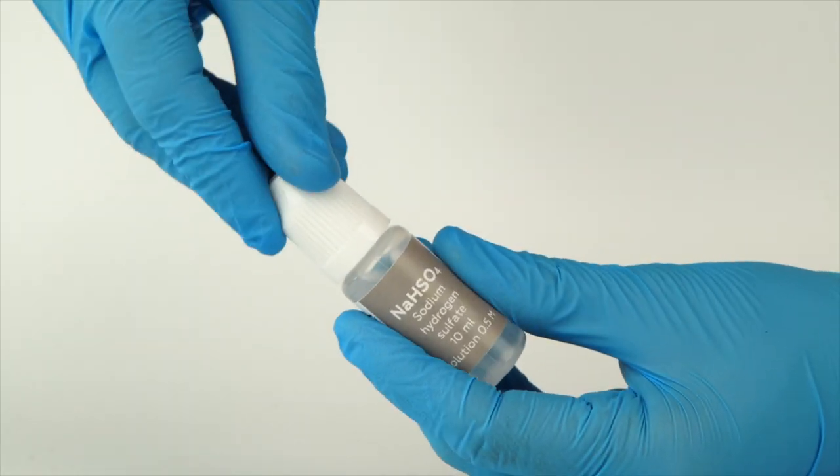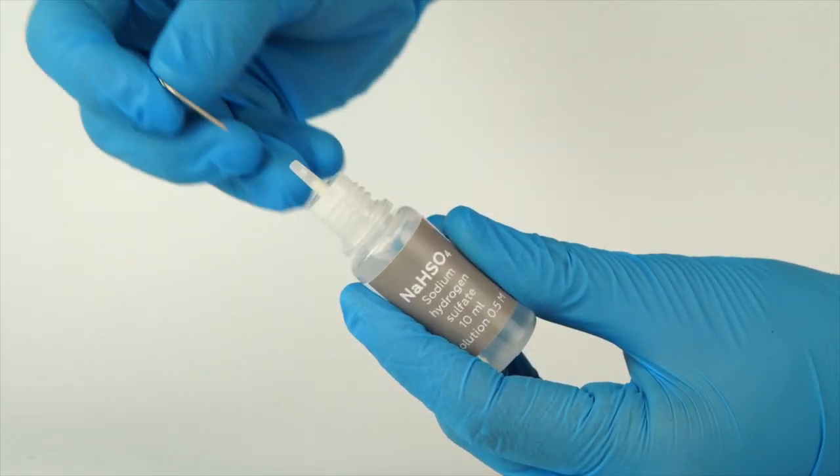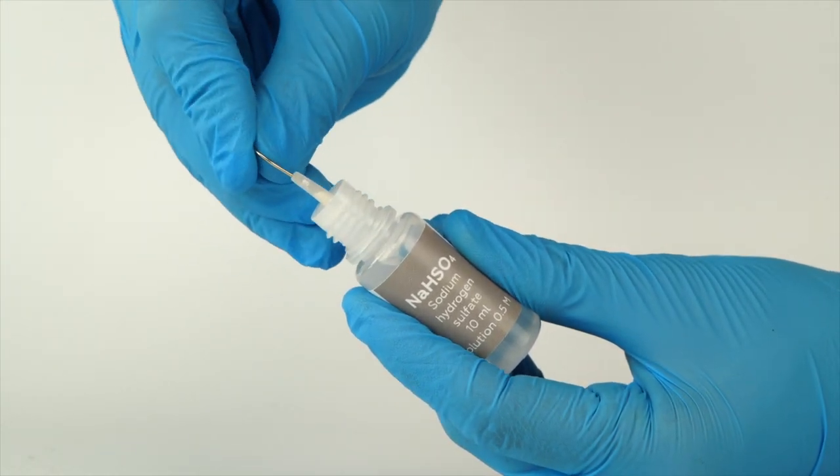To open a bottle containing a reagent, push the cap down and turn it. Pierce the bottle nozzle with an unbent paper clip.